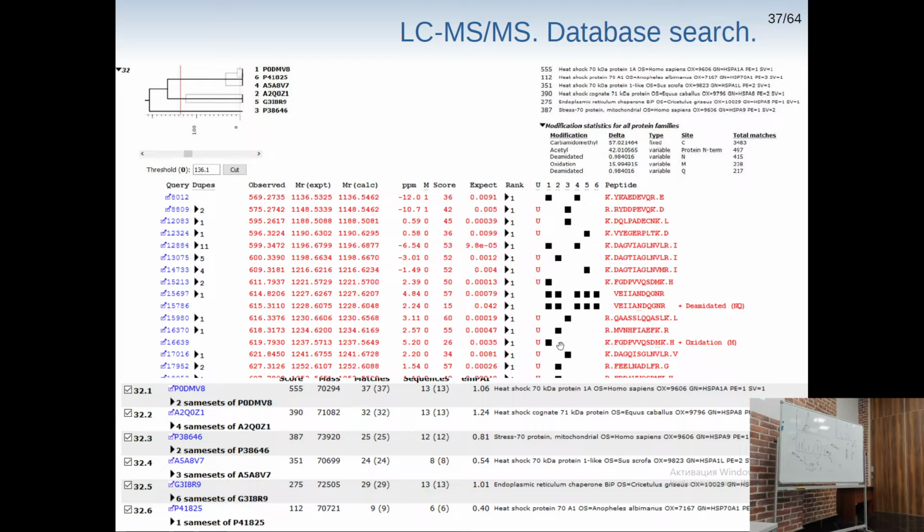We have a lot of unique peptides here, which are unique even for this database, which includes human, pig, horse, and so on. What do you think? Which is the right one? Also, we have a number of dupes, a number of peptides which were identified during the run. For instance, if you have really high concentration of some peptides, the peak would be really wide, and the mass spectrometer will get time to get it not just once, but let's say a lot of times.